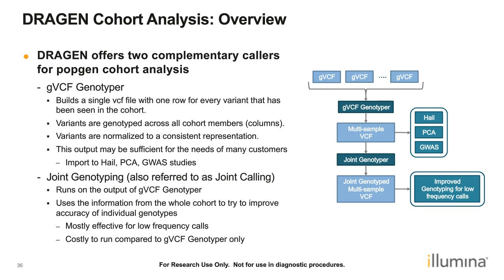You generate your GVCF files from your small variant calling. Then we've split that into two parts where you can use DRAGEN to speed up this analysis, which is now done even much faster with the FPGA offload. And then we now have a software-only offering that can do the large-scale cohort calling.